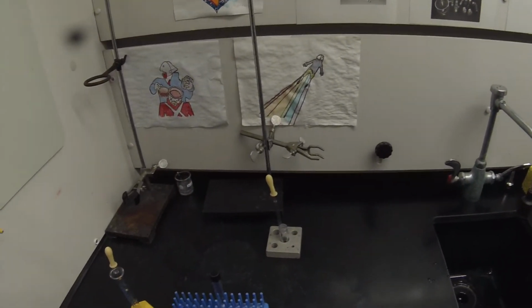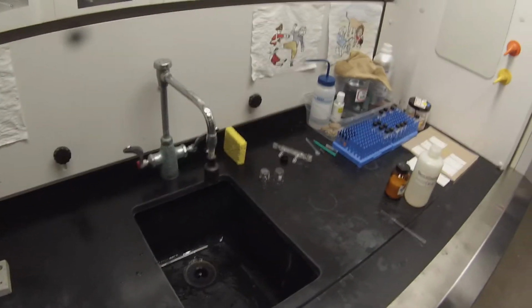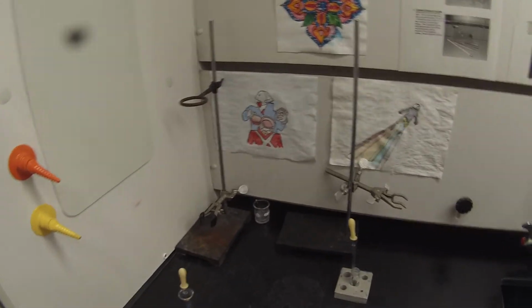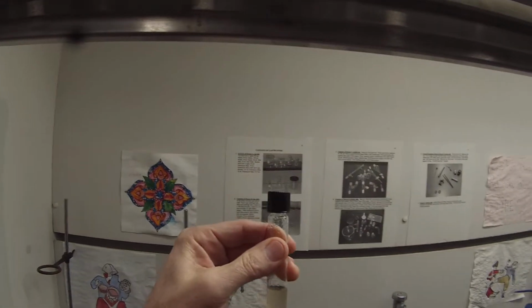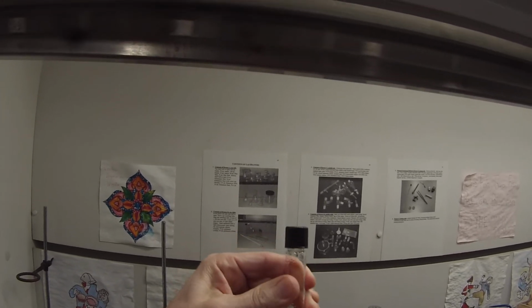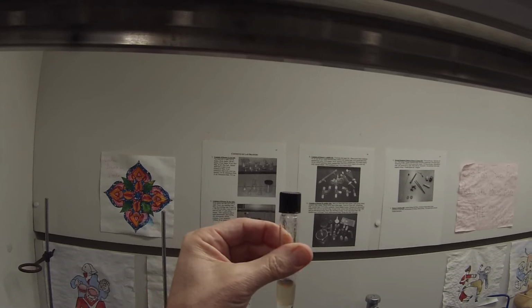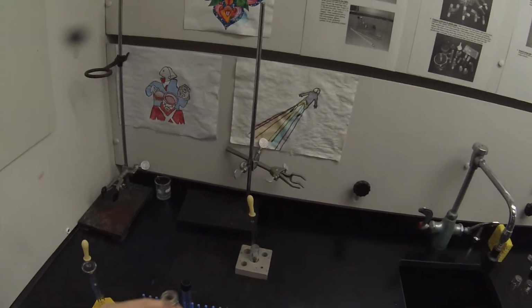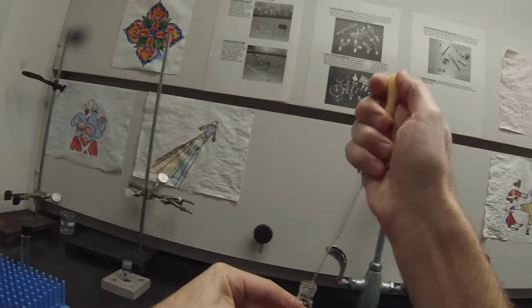Waiting for those layers to clear up. I want them to be completely clear on this last wash so I don't lose any of my ester in the water layer, or take as little as possible of my aqueous layer into the organic, so I don't waste it by adding too much drying agent. Pretty clear. Top layer is going to be a little cloudy until I add it to the sodium sulfate.